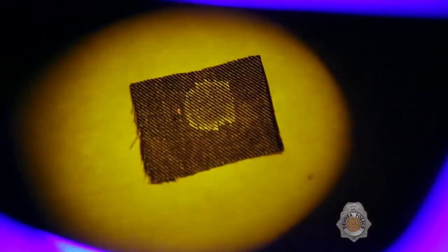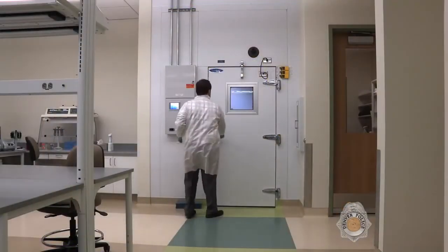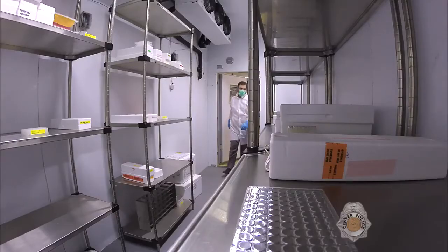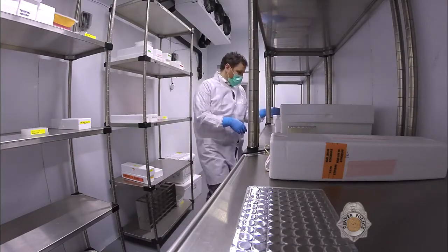Stains not visible to the naked eye can be located with an alternative light source. Some body fluids fluoresce under this blue light, making it a useful tool for finding stains that aren't visible using natural light. Any biological evidence obtained is stored in a walk-in freezer until it's ready for DNA analysis.